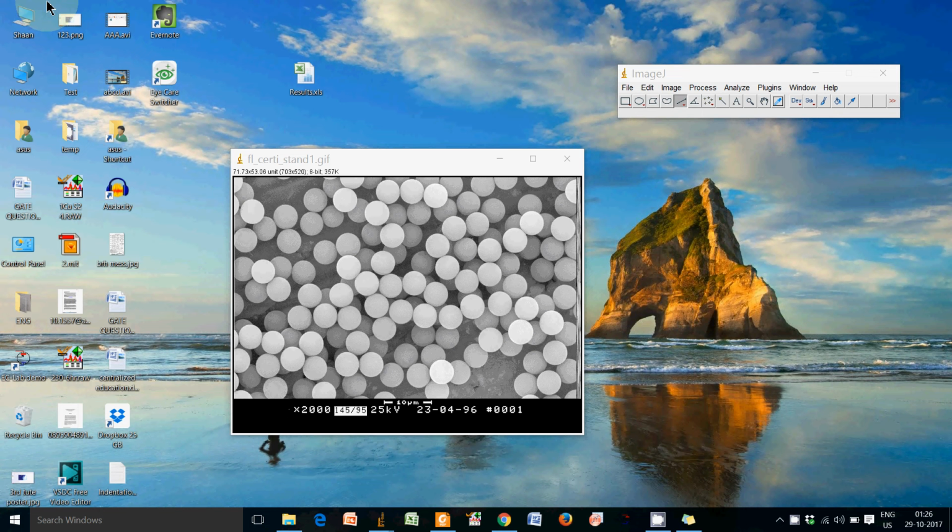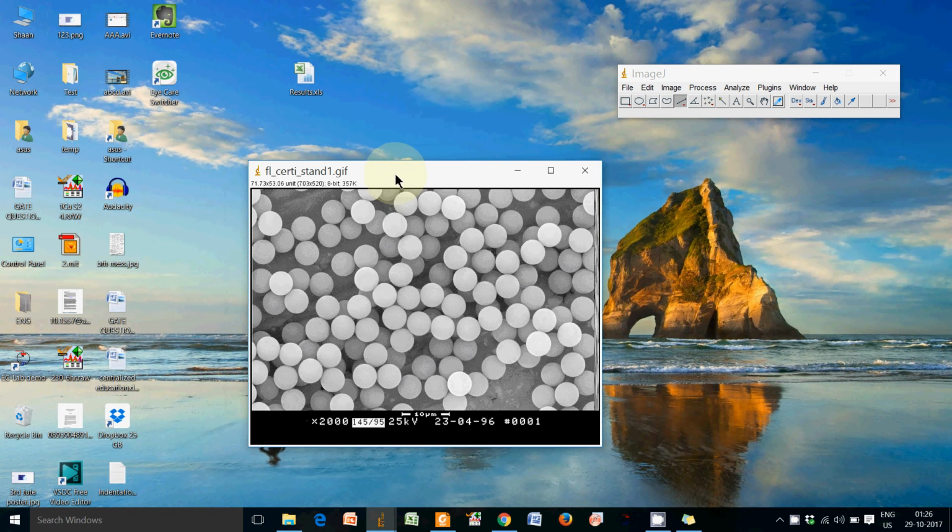In our earlier tutorial of ImageJ, we have explained the basic image analysis like distance measurement and area measurement using ImageJ software, both by thresholding and manually option. In this tutorial, I will explain one more process for area measurement using binary option without doing thresholding, and it will be as useful and time saving as doing it thresholding. So let's start it. As you can see, this is our image that I will use for analysis.